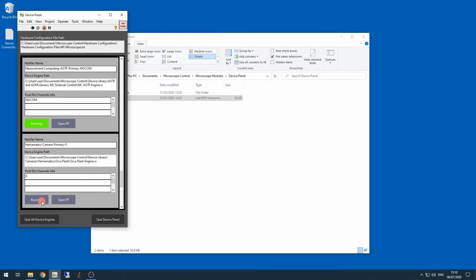And now we get to the Hamamatsu Orca Flash. For some reason, when you initialize this camera in LabVIEW, the computer always hangs for a few seconds, so make sure you wait a bit before you start trying to click on things after starting this camera.